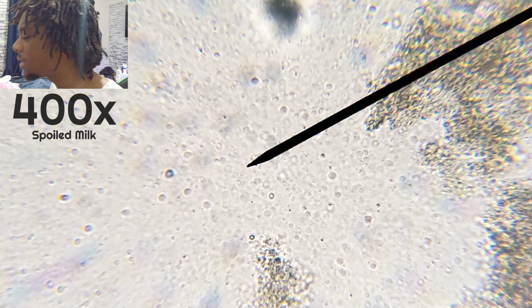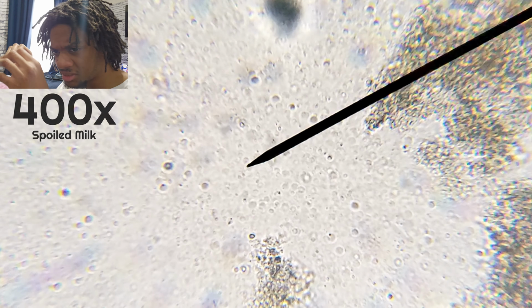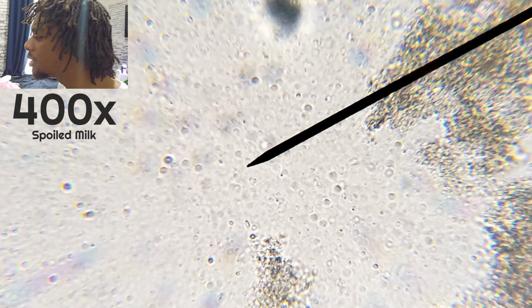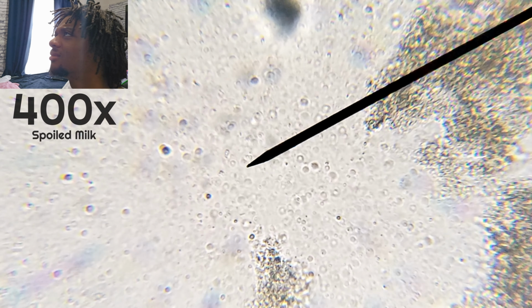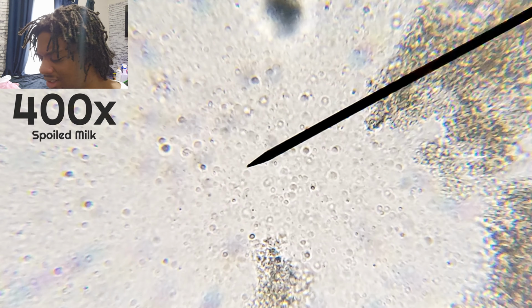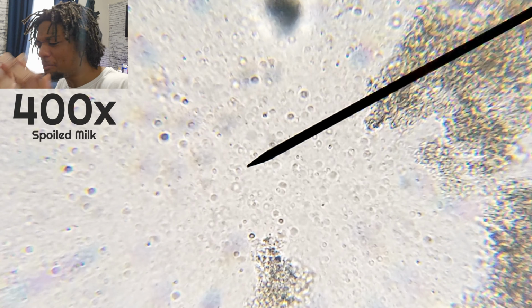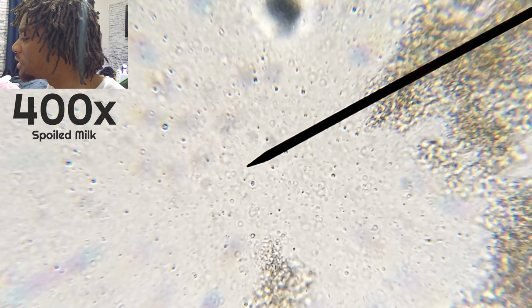Alright. Just because I'm a curious boy doesn't mean I'm a well-informed boy. I'm not sure there'd be much Brownian motion, is there? When bacteria just move like that. Given that this is a liquid, I'm not sure. Well, isn't Brownian motion mostly for stained bacteria slides? Like I said, I'm not the most informed, alright? I'm just learning, okay? I'm attempting.